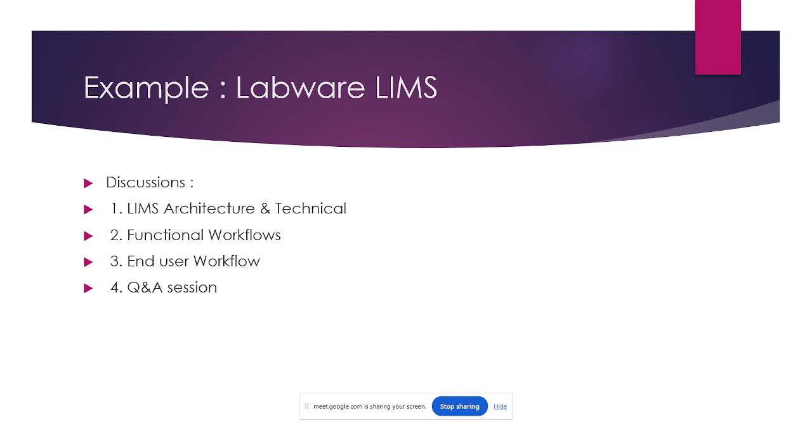In this workshop, first we will discuss the LIMS architecture and technical part, then the functional workflows, and then the end user workflow. Finally, there will be a question and answer session.